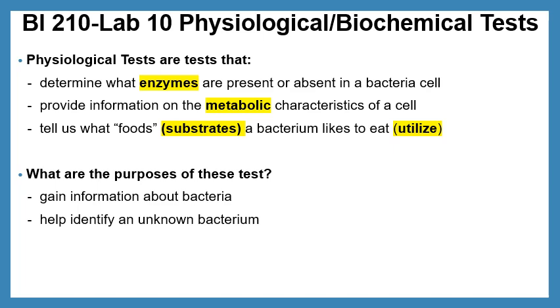So throughout these PowerPoint slides, we are going to look at the different physiological tests that we are going to study this semester in this course. There are many other tests that we are not going to look at that also play an important role in the metabolism of certain bacteria. It is important to note that not all bacteria possess the same enzymes. So we're gaining information on seeing what enzymes and metabolic processes are occurring within the cell.